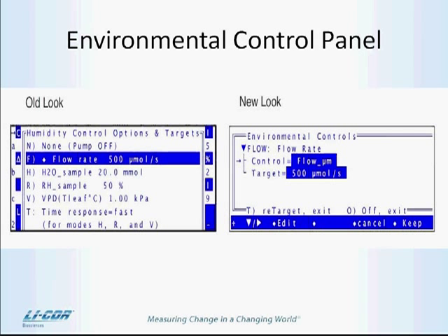We started using the tree structure in limited ways in 6.1, and so what we're trying to do is make sure that everything is on the tree structure. In the end, that makes it really consistent and easier for you to move through it, but it also means that if you haven't used the tree structure before, you may find it a little bit uncertain as to where you're supposed to be going and what you're supposed to be doing. So hopefully this will elucidate what's going on here.